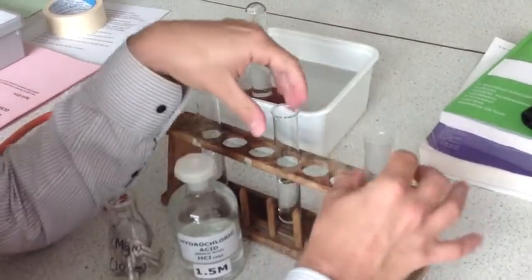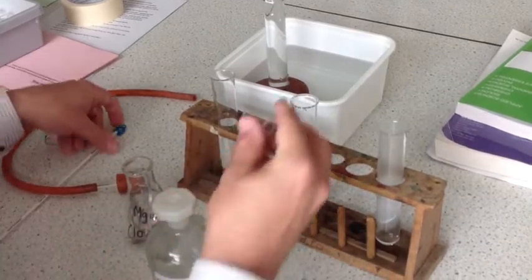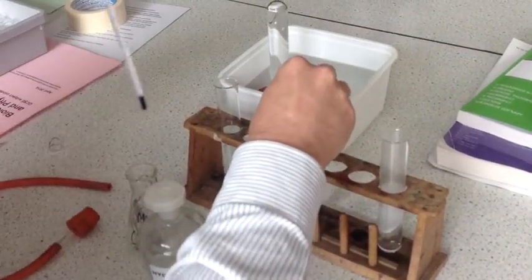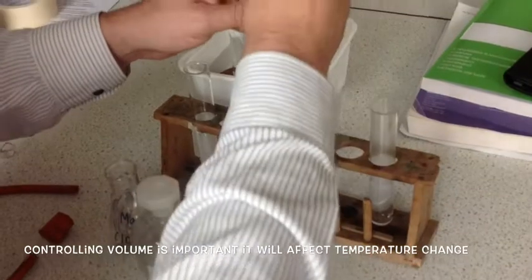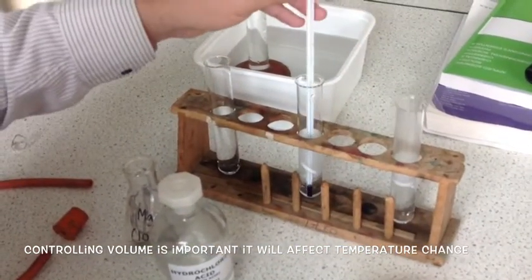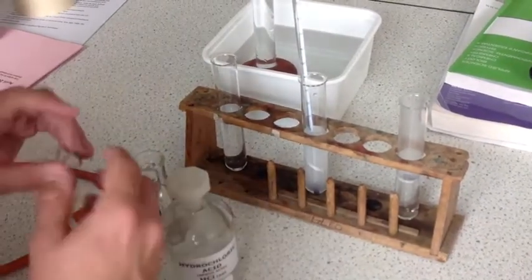So in this one, I'm going to look at the time or the temperature rise when the magnesium is added to the acid. So the same piece of magnesium to the same piece of acid. Firstly, before I do that, I'm just going to check the temperature of the acid there, and it's at 22 degrees. And then by adding in the magnesium, I can monitor the increase in temperature, because this is a type of reaction called an exothermic reaction.